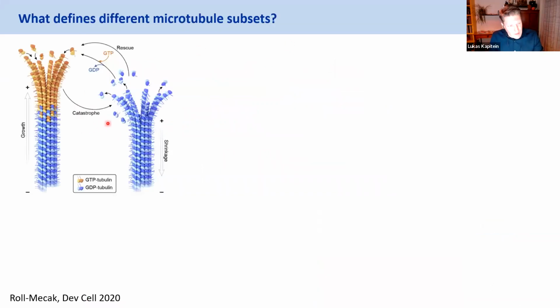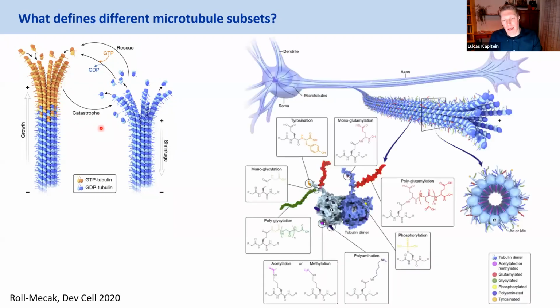This is what I was telling you about microtubules. Microtubules are dynamic polymers, they grow and shrink, but in neurons there is a large population that somehow is stabilized, and because they are long-lived, they accumulate these different post-translational modifications that supposedly change the function of the microtubule, perhaps by changing the structure or recruiting microtubule-associated proteins that can recruit or inhibit binding of different motor proteins.